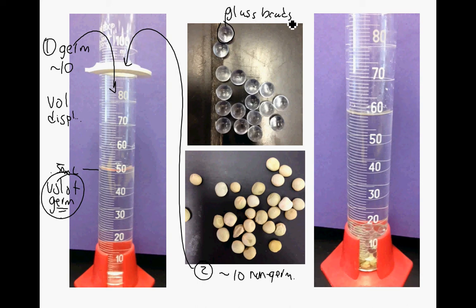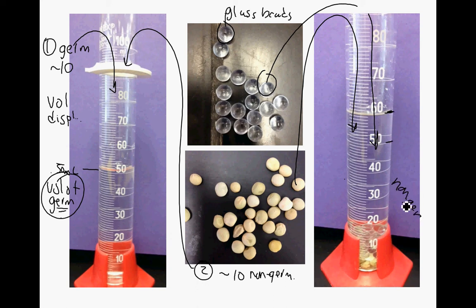So what you're going to do is, on the right here, I've put these non-germinated seeds into the graduated cylinder, and then I put enough glass beads in here to make that volume. So I started here, and to make this volume of the non-germinated equal to the volume of the germinated. If you didn't follow that, go back and rewind and do that again.